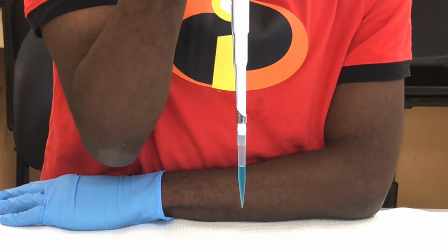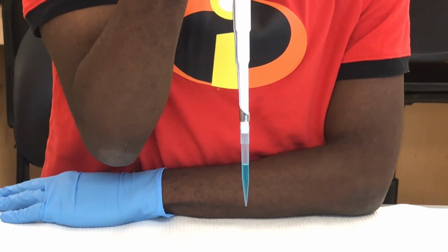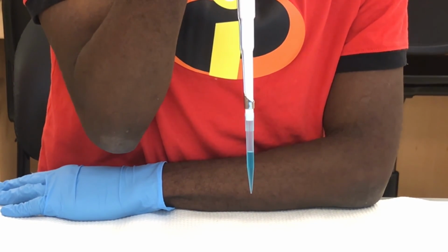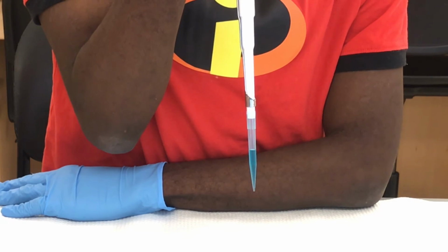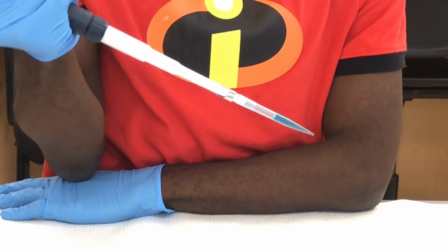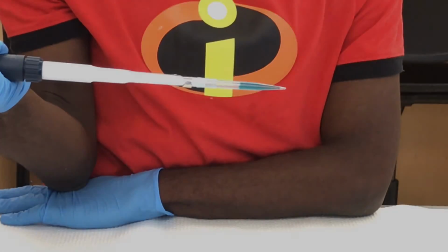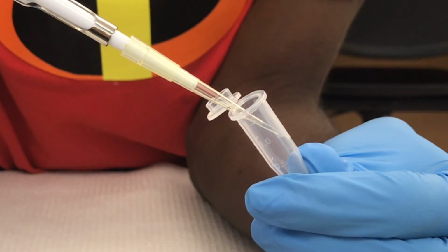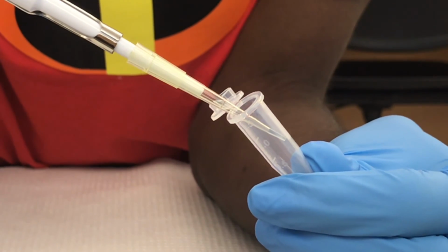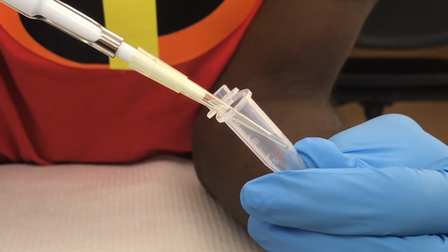Never lay down or invert a pipette with liquid in the tip. The liquid can enter the body, causing corrosion, contamination, and inaccurate pipetting. Notice how even a slight tipping of the pipette can cause movement in the liquid in the tip. When pipetting small volumes, remember to touch the tip to the side of the container to make sure that the full volume of liquid is delivered to the container.